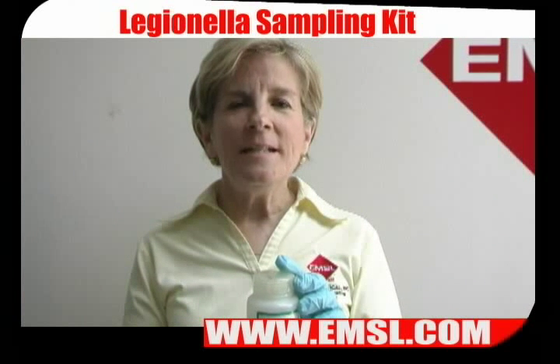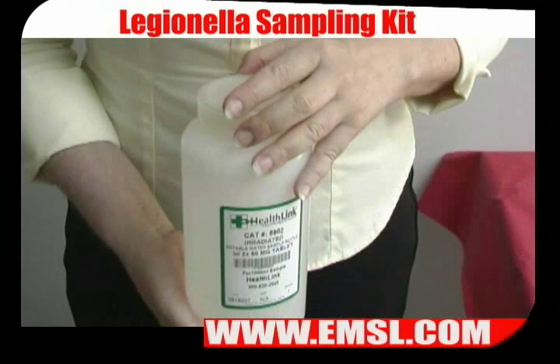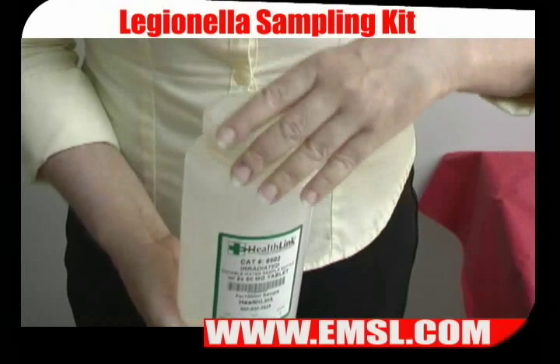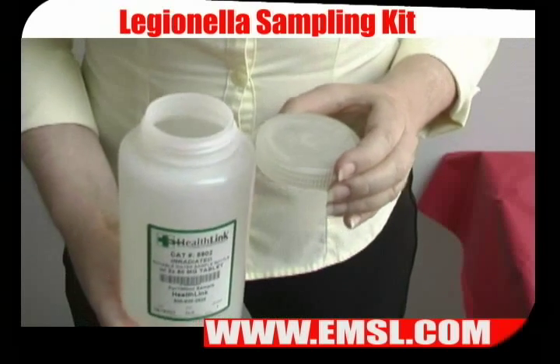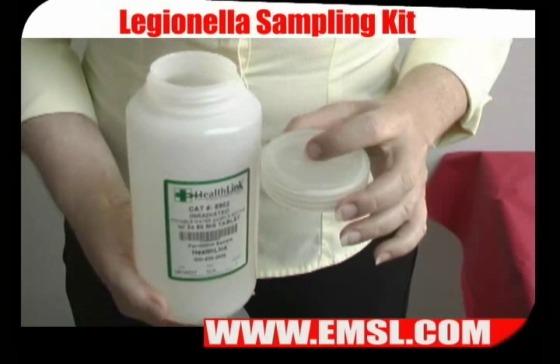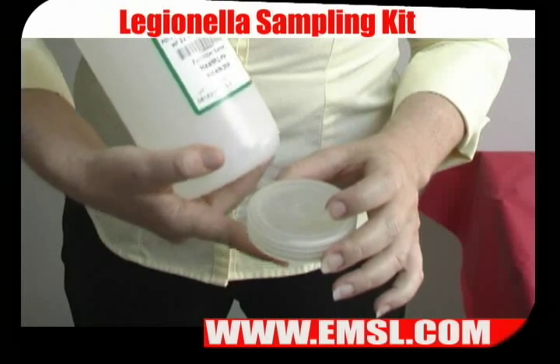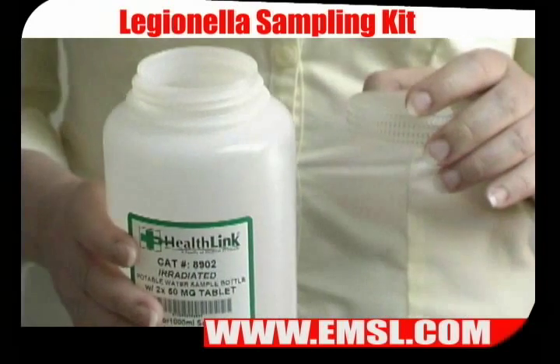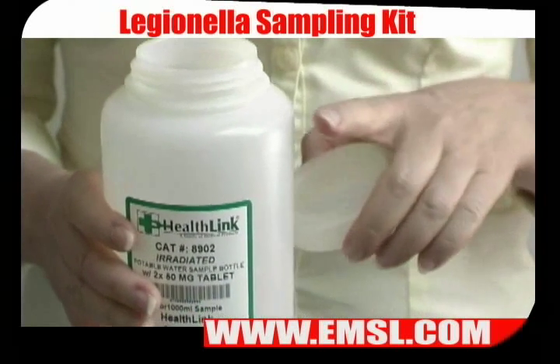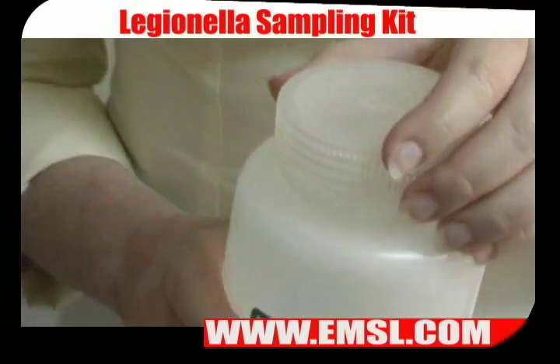Before you take any sample, make sure that you have your nitrile gloves on. If you're using the 1,000 milliliter bottle for potable water sampling, first unscrew the cap, being sure to hold the lid topside up to avoid airborne contamination touching the bottom of the lid. Next, fill the bottle with your water sample — don't completely fill it; make sure there is an airspace inside. Then close the lid tightly.